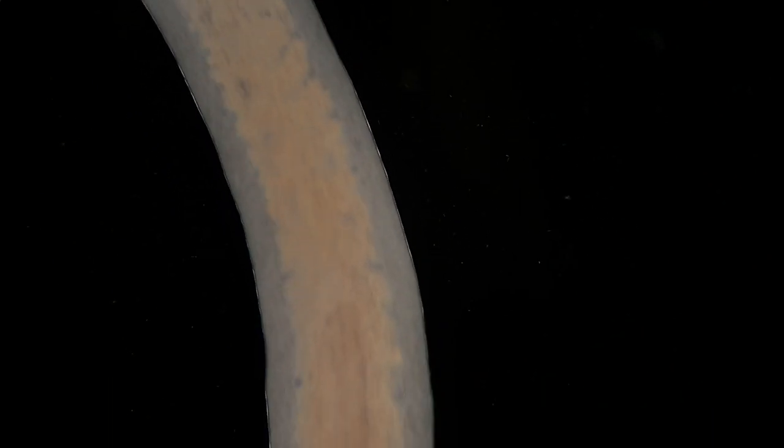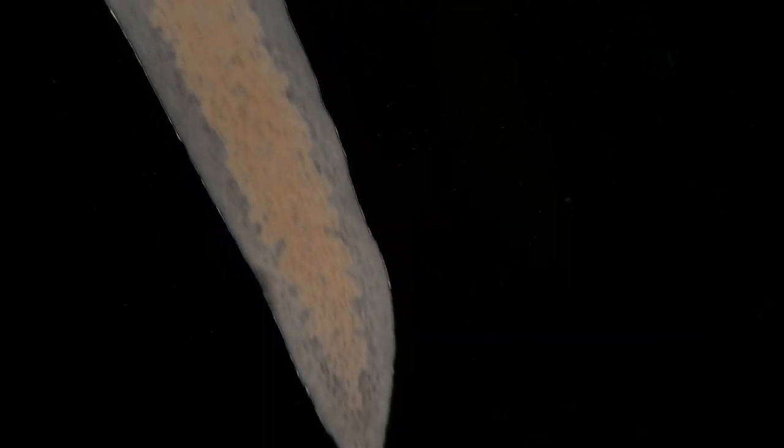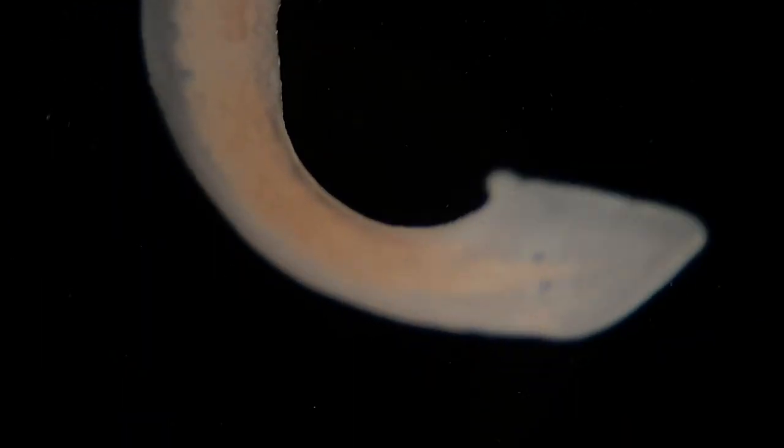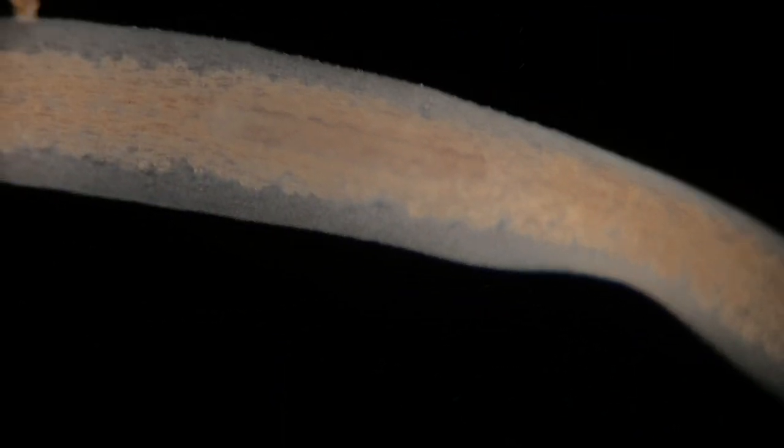Just like the snails, they do have two adorable little eyes. I just gotta say, with all of the things that I look at under the microscope, most of them don't have eyes, or if they do, they just have a small little eye spot. So it's nice when you do see something that has two eyes because you can actually, I don't know, it feels like there's a little bit of a connection there. I'm a little bit more closely related to this.